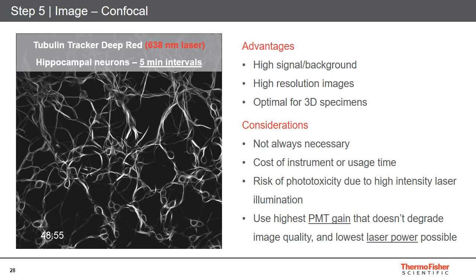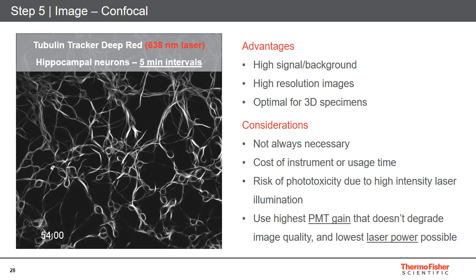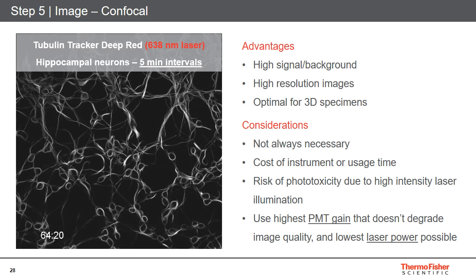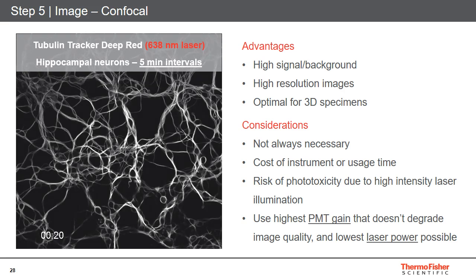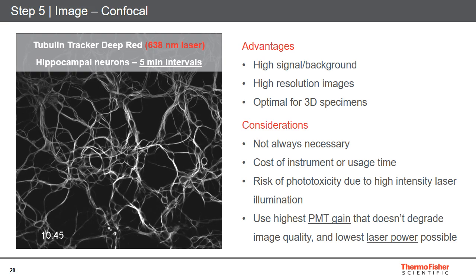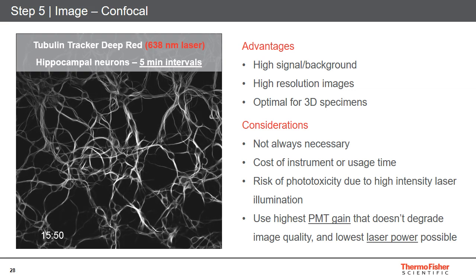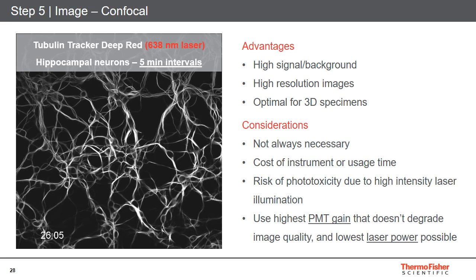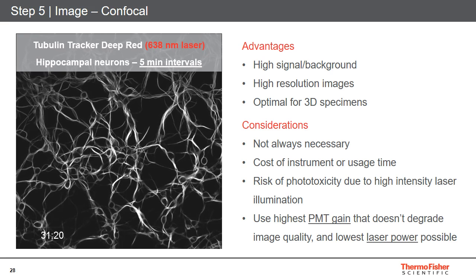Some considerations to think about before moving from a wide field to a confocal is that it may not always be necessary. Oftentimes the confocal instruments in shared facilities will have a cost associated with them, and that cost may not be necessary for the experiment that you're trying to perform.